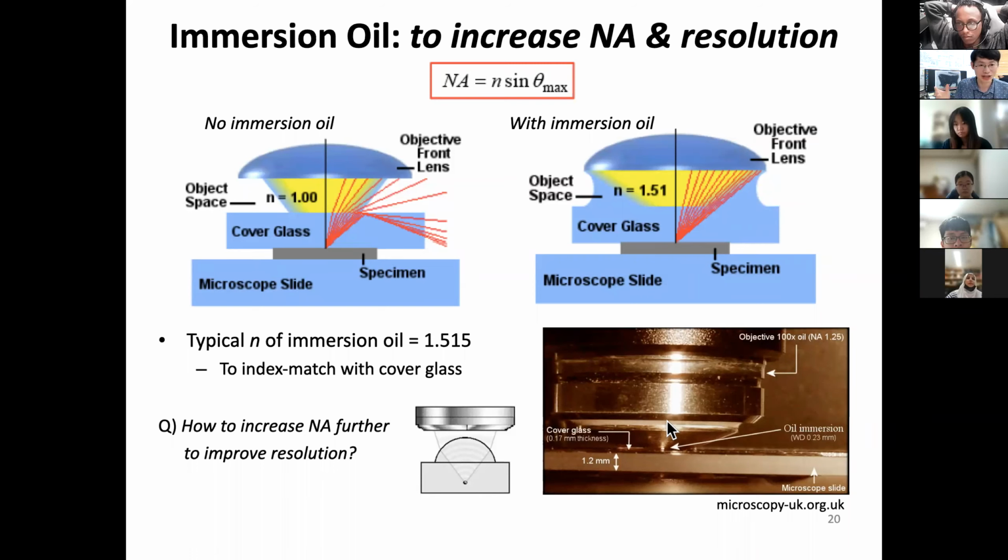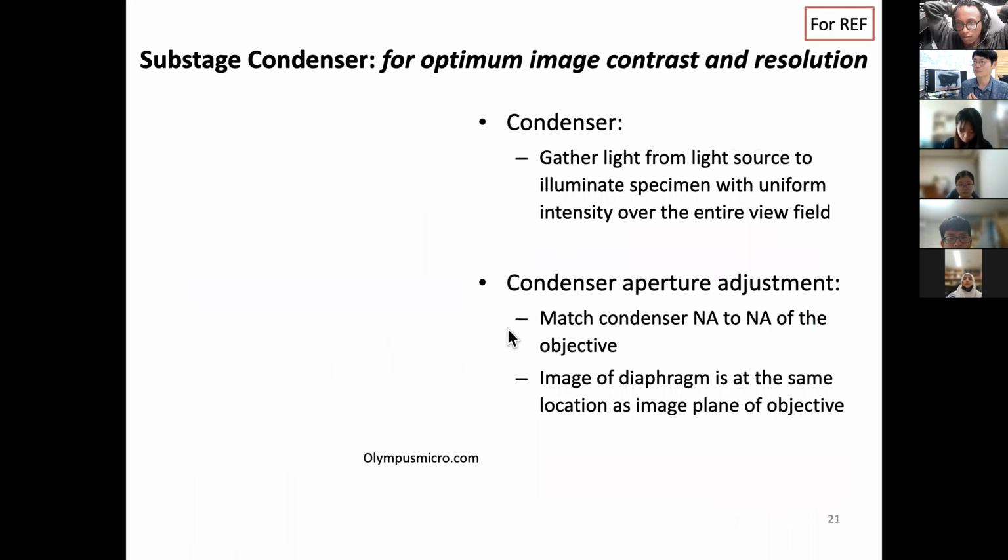That's the worst thing that can happen. So you've got to be super careful. The rule is, when you put your objective close to your sample, always turn the knob away from the sample while you are focusing. That's the practical tip you should have, and it is extremely important when you are dealing with your actual samples.